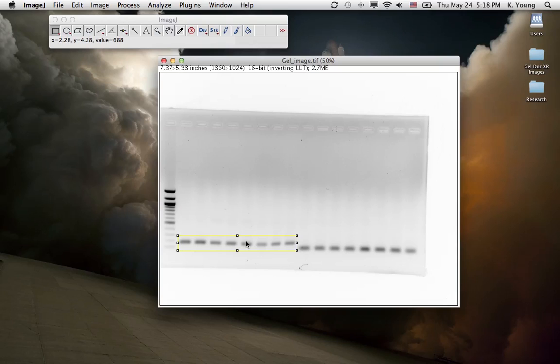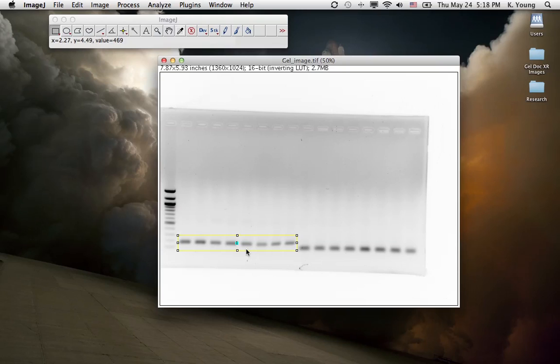pressing Command 1. You see a little 1 pop up? That means we're designating this area of interest, number 1. For PCs, it's going to be Control 1.